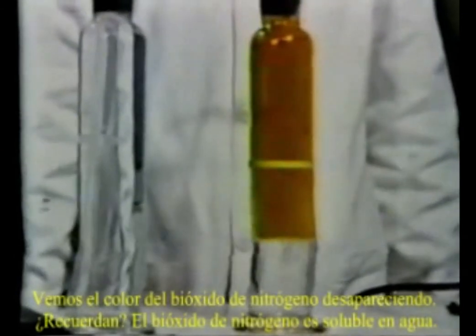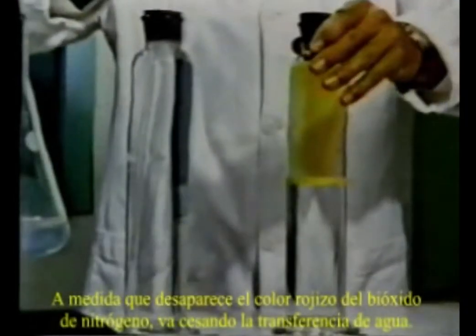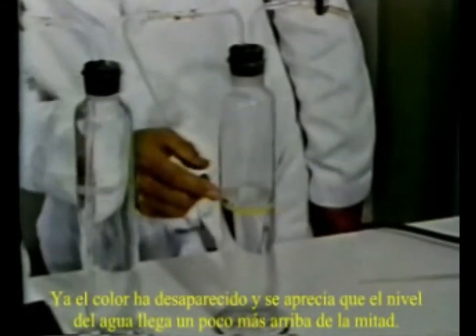We see the color of nitrogen dioxide is decreasing. Remember, nitrogen dioxide dissolves in water. As the nitrogen dioxide color disappears, the water transfer ceases. Now the color is gone, and we see that the water level is slightly above the halfway mark.